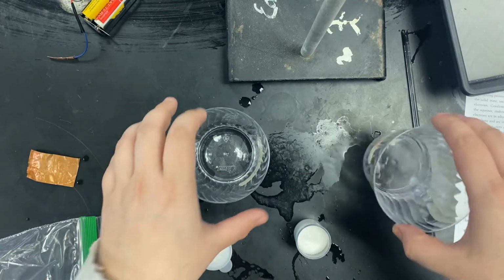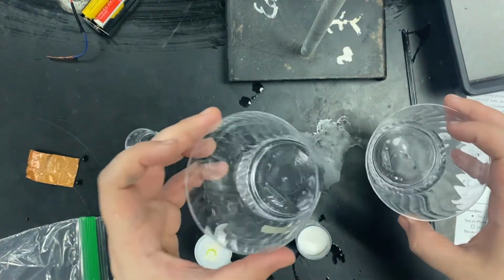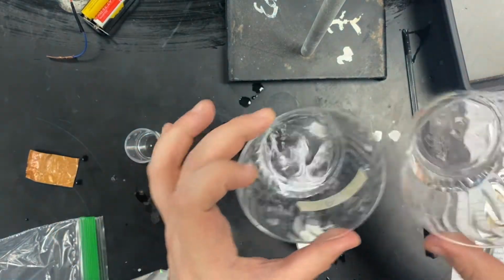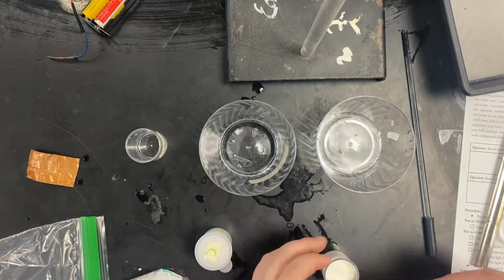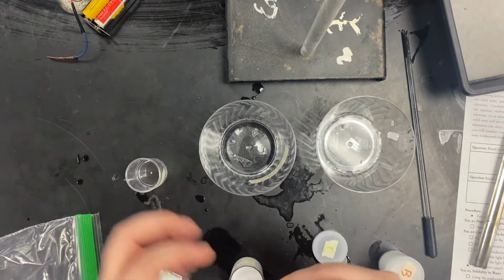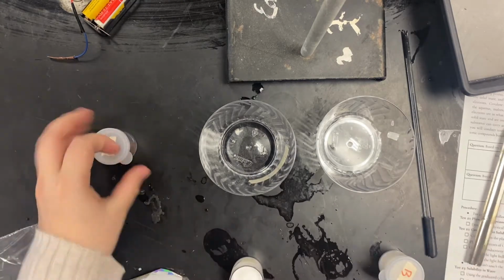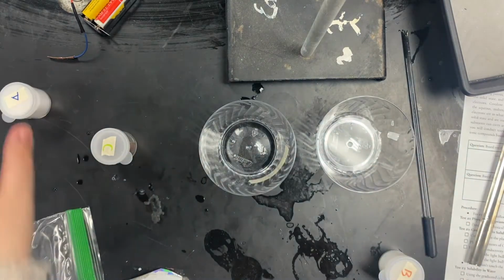After you've stirred both cups for about 30 seconds, look at them and see if your mystery substance has dissolved and whether or not it is soluble in water. Now, once that is done, just make sure everything is covered. When you're recapping stuff, make sure everything matches, that the top and the container match.